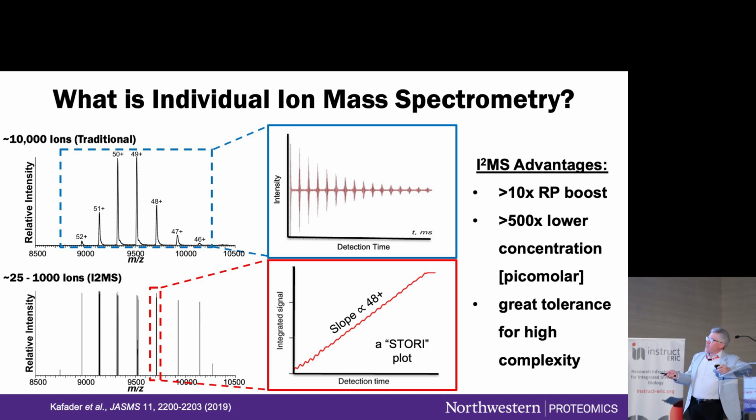And so in that single peak, for example, by 2018 we knew this could work. This was joint with Thermo Fisher Scientific, a co-invented technology, and it was just released recently. What we did is just say, okay, we're going to create what's now called a STORI plot, and we're going to integrate the signal over time.